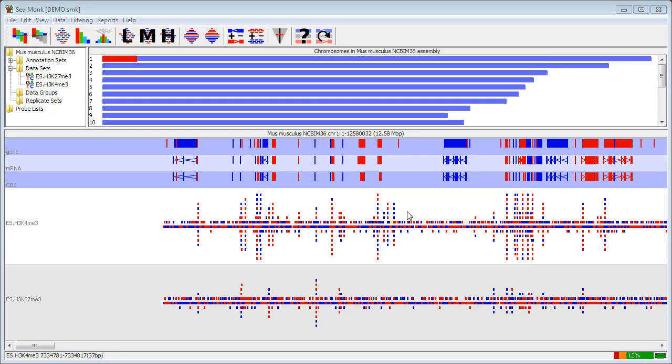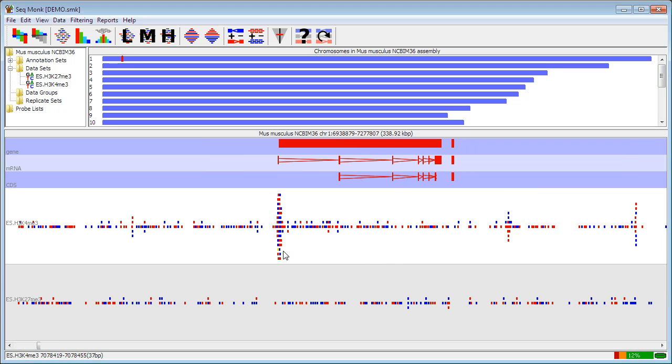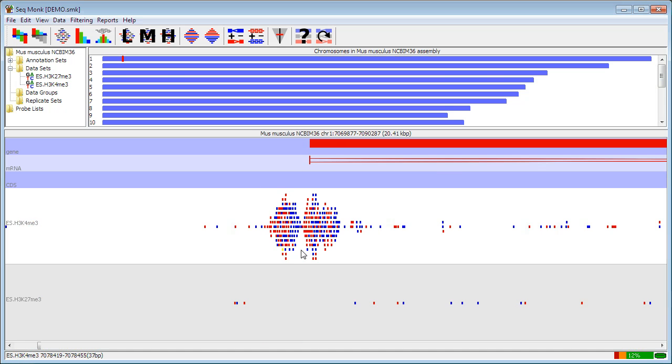We're going to take a look at how to look at your data in SeqMonk in a more quantitative way. Previously, when we've looked at data in here, we've just used the normal data visualization tools to look at the raw data in the context of an annotated genome.